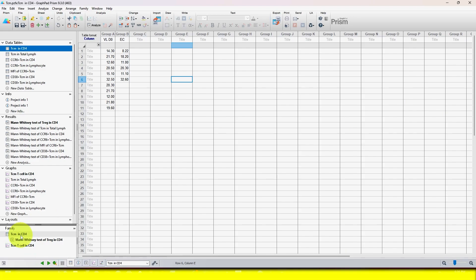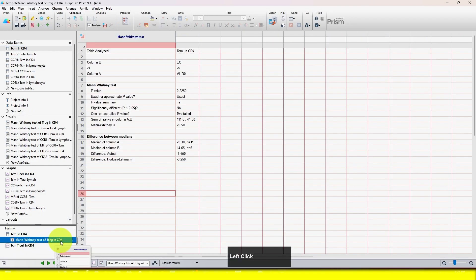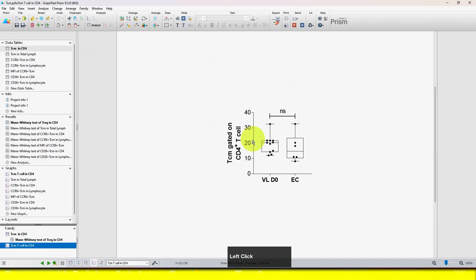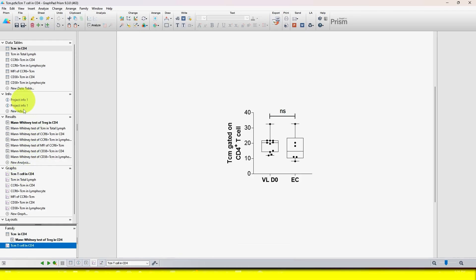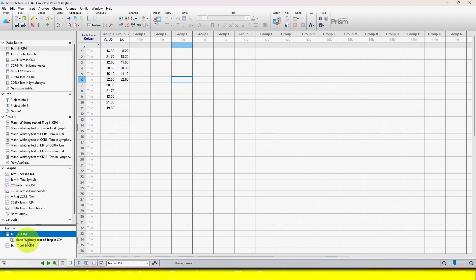If you click on the first item in the Family panel, you can see the data file. If you click on the middle one, you can see the result file. And at the bottom, if you click, you can see the graph file. So this is very easy — you don't need to scroll down or select any file manually in the main section.